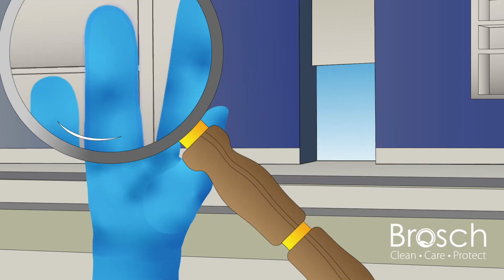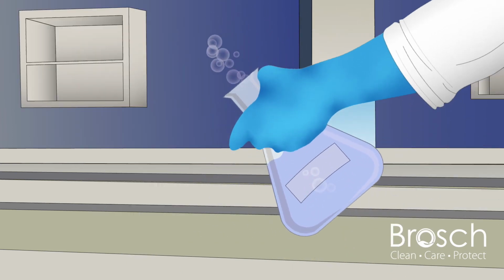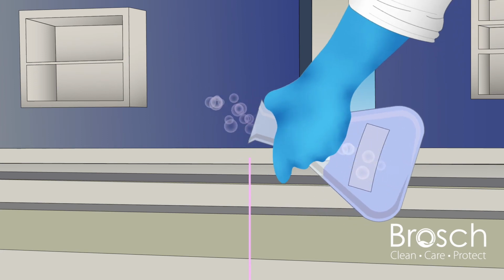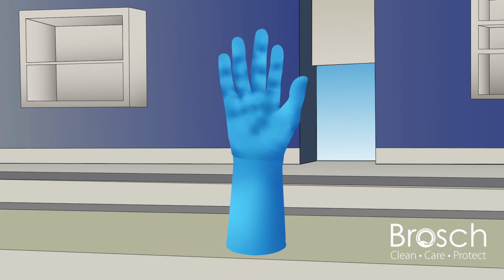Thicker gloves are suited when working with chemicals. Remember to check chemical guidance information. While thinner gloves are ideal for those who need the flexibility and dexterity when carrying out certain tasks.